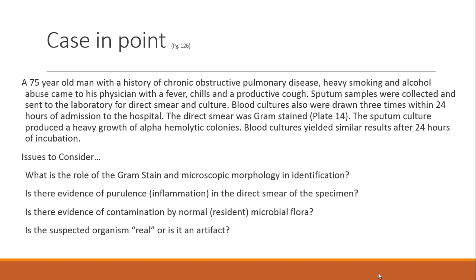So based on that gram stain that you would give, and the physician will have those gram stain results long before he has the results of the culture, the physician can go ahead and start treating the man for a gram-positive cocci.